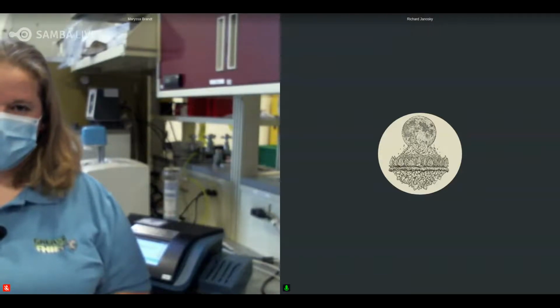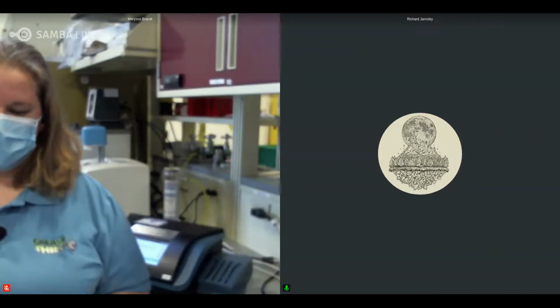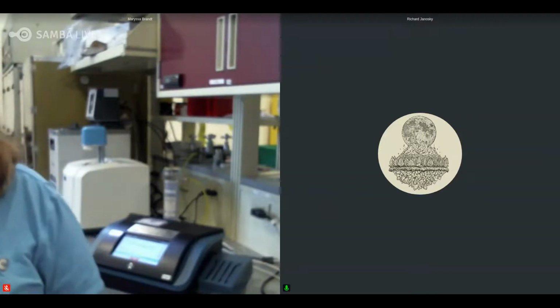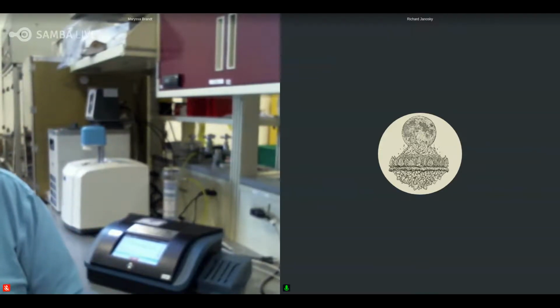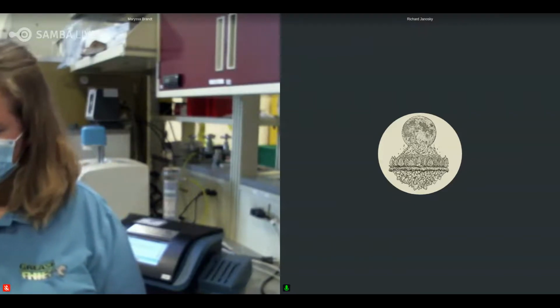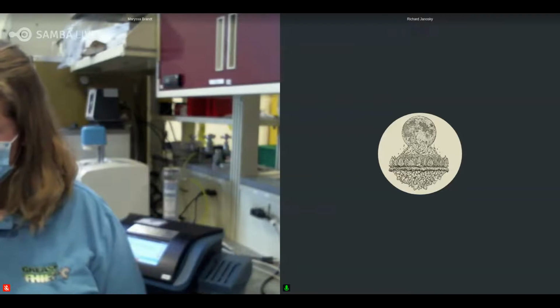Doug was really helpful in getting us set up for the grease program, and through our study, we're finding that we can see a little bit of rate increase from that latent moisture when we cap the vial. You see that dive down to almost no moisture, and then when the grease is heating up, it takes about 29 to 31 seconds for that moisture to start being released. So our purge, for example, for grease is 30 seconds. At the end of the purge, you'll see that the moisture rate is down at almost zero. And then right as the test is starting, you will see the rate increase, and the moisture is then being driven out of the sample and collected for the duration of the test.